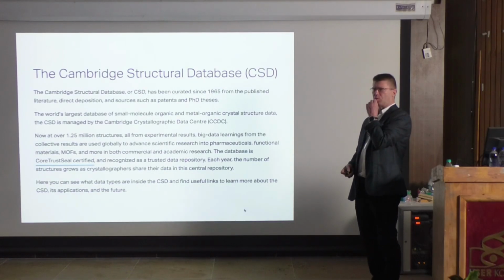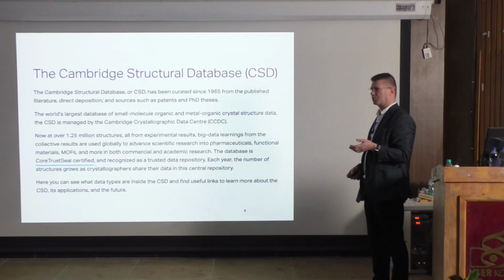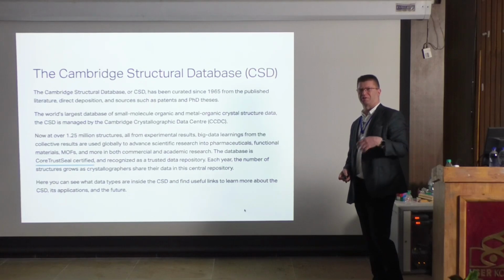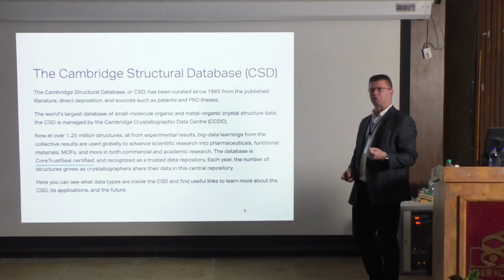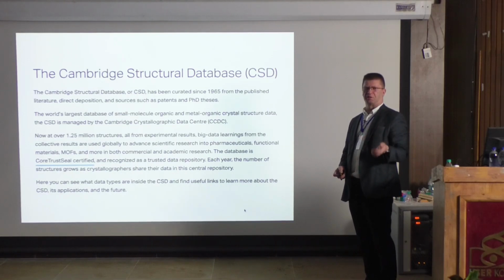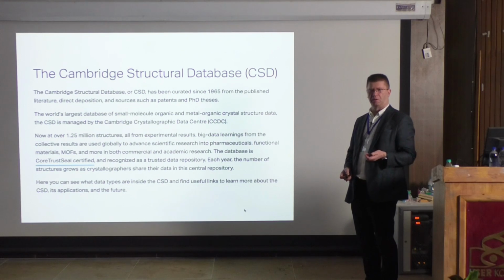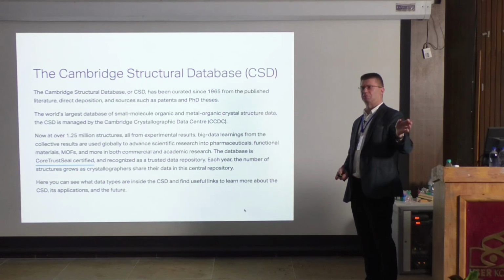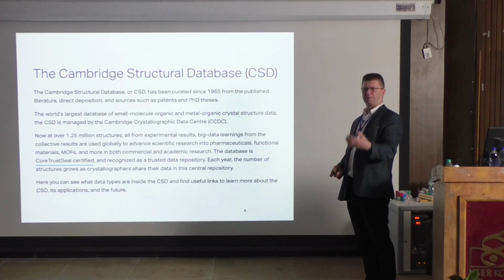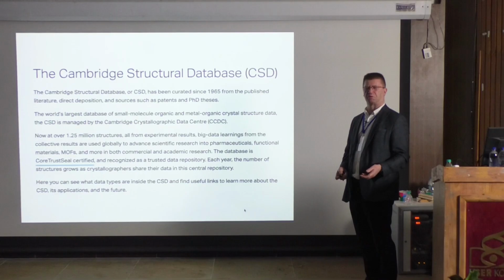But now quite quickly I will go through the Cambridge Structural Database. The only difficulty with the Cambridge Structural Database is that it's not free of charge. So you have to have your institute or national institute license to use it, but I will show it to you anyway because it's a very nice tool for checking if the structure is known. If somebody else did it, and when, and where. So that you don't repeat the same thing, so you don't publish the same thing. This has been published 10 times already. Okay, I don't want to publish because it's already known.